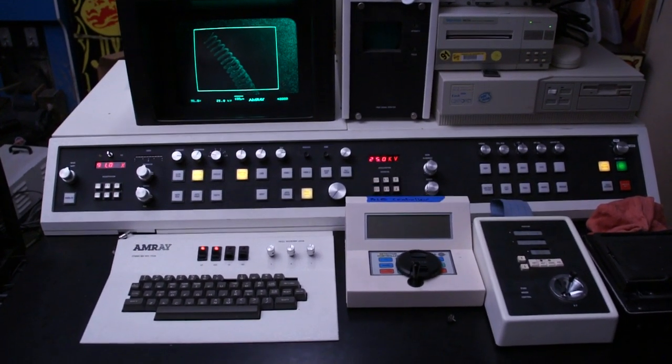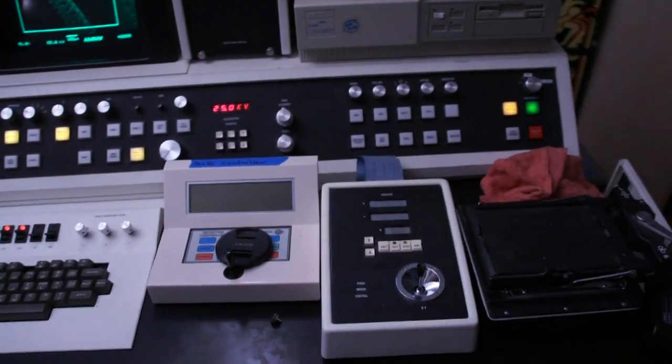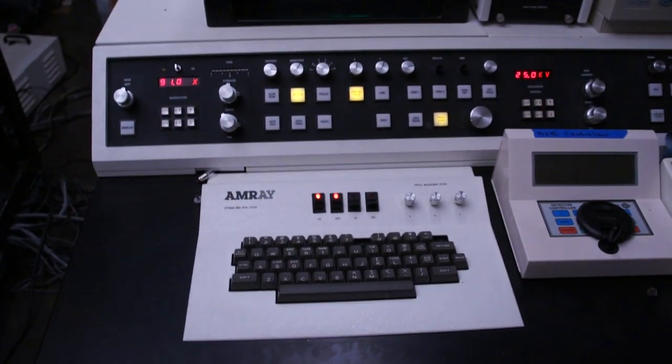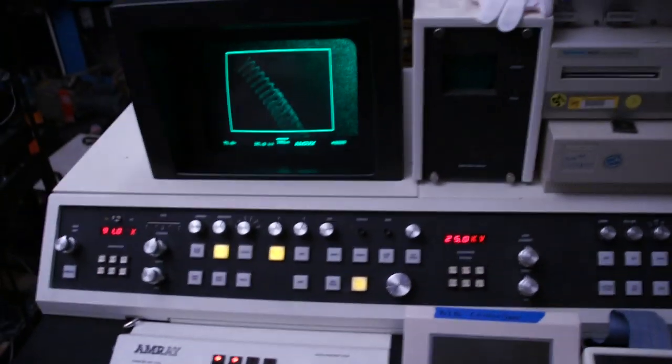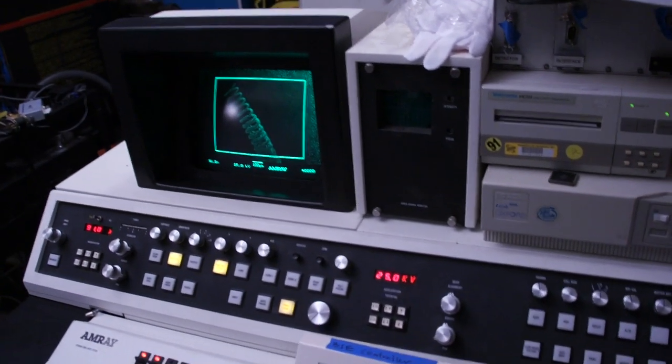This is an AMRAY 1800 field emission. Here's the console. This thing looks really high-tech with all these buttons. It'd be great for a B sci-fi movie. So if I ever do one, you'll probably see this in it.